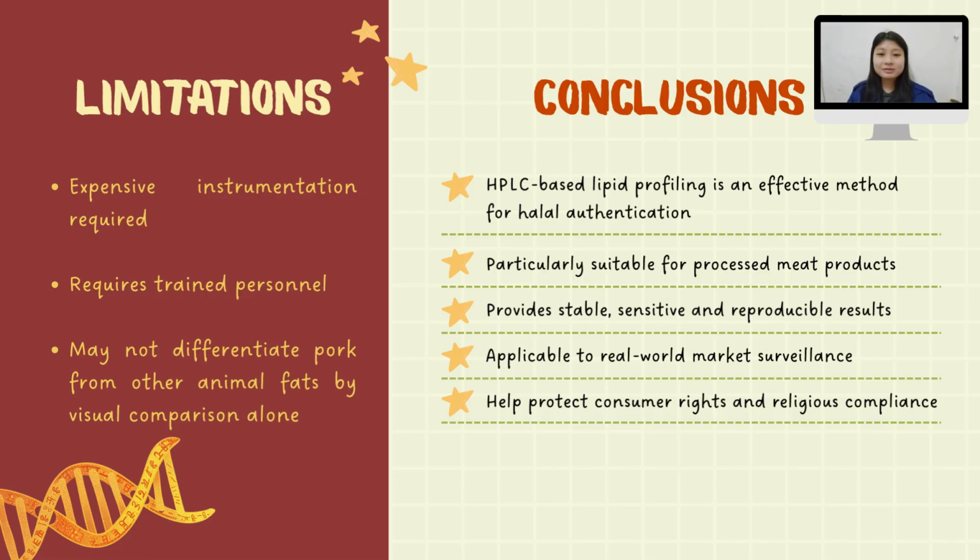However, there are some limitations for this HPLC method, which include the expensive instrumentation, need for trained personnel, and difficulty differentiating pork from other animal fats by visual comparison alone.